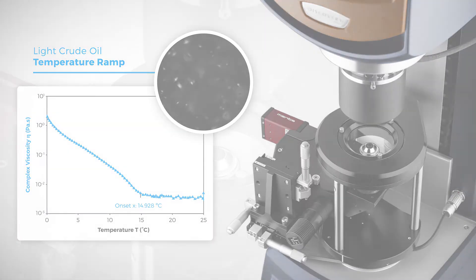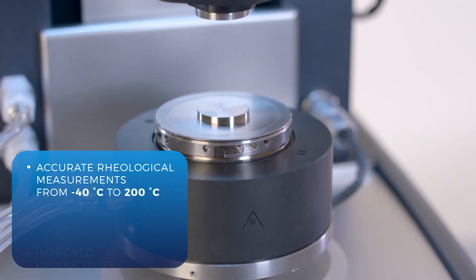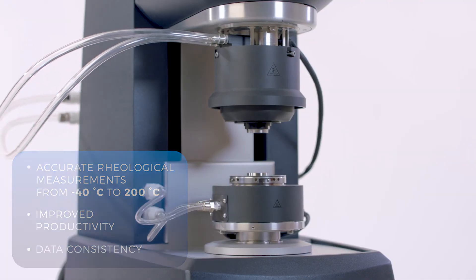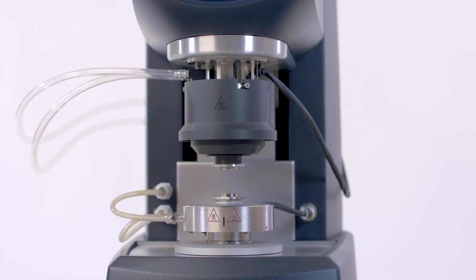If you require the most accurate rheological measurements from negative 40 degrees Celsius to 200 degrees Celsius with improved productivity, while maintaining data consistency across different lab environments, the Upper Peltier Plate for the Discovery Hybrid Rheometer offers you the complete solution.